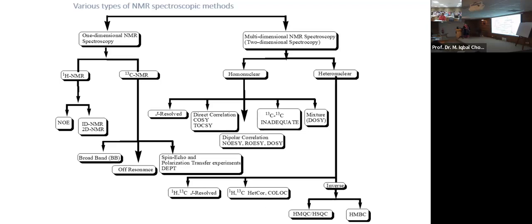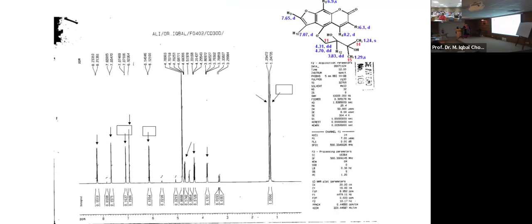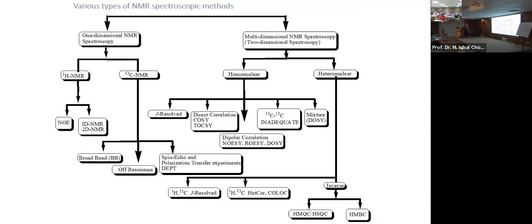old time, meaning no one is using them nowadays, but the experiments are there, so you can definitely record them, because these inverse NMR experiments are far more sensitive as compared to COLOC and HETCOR.